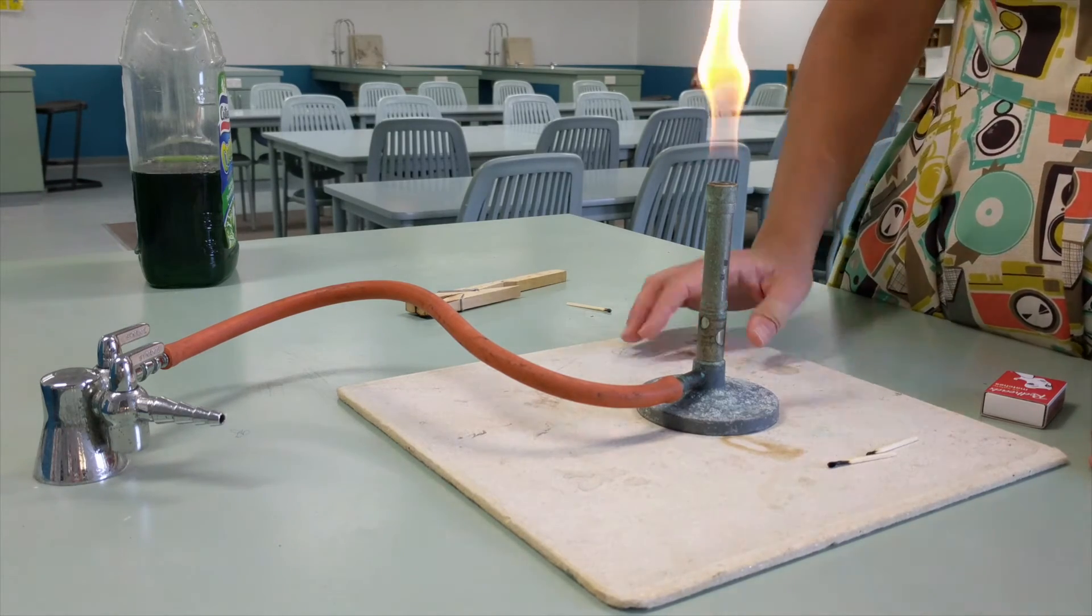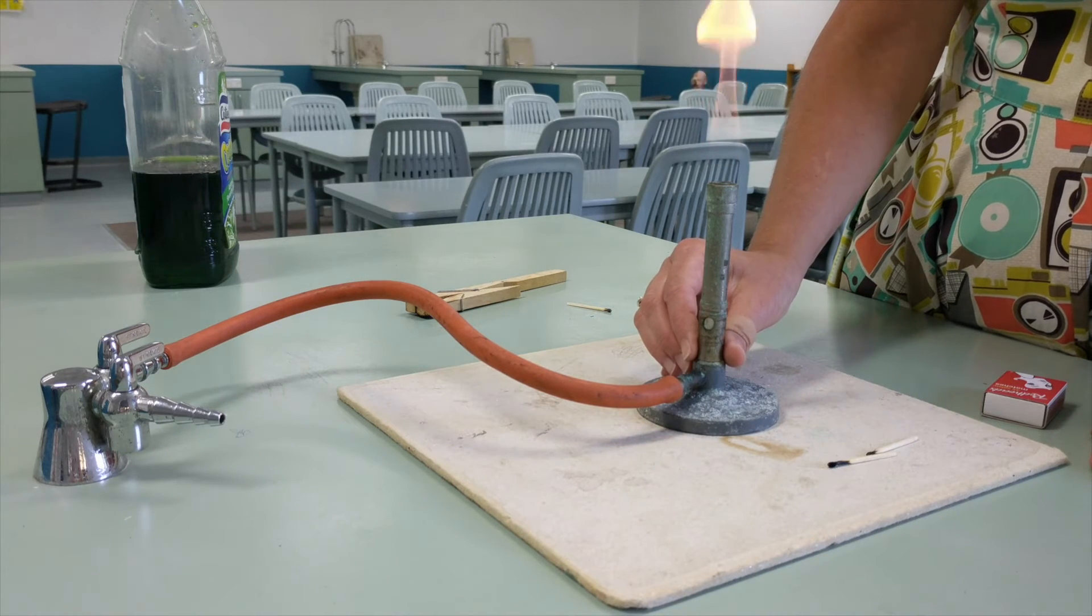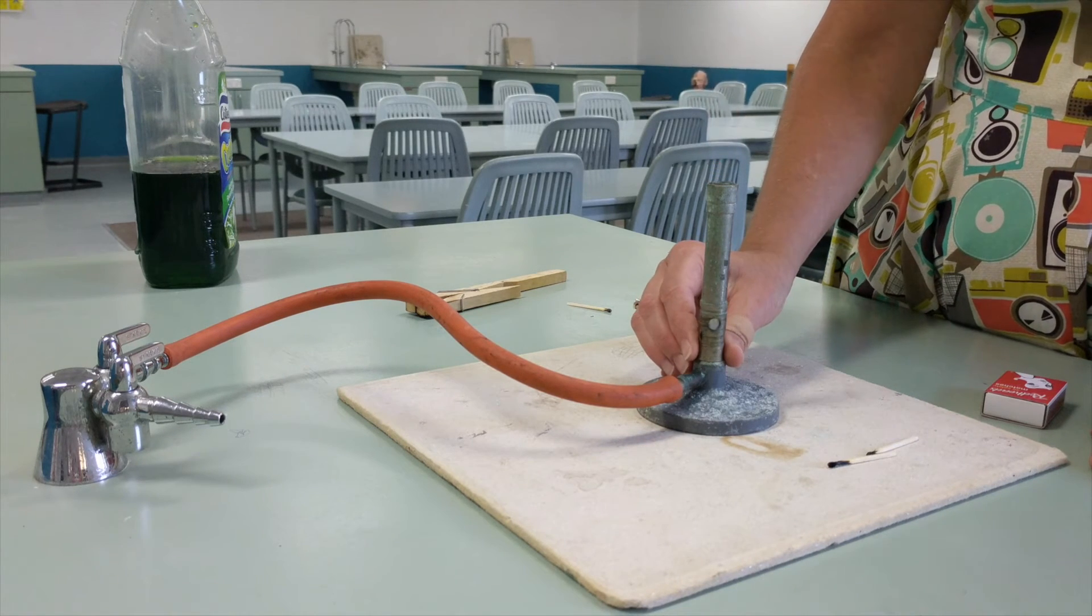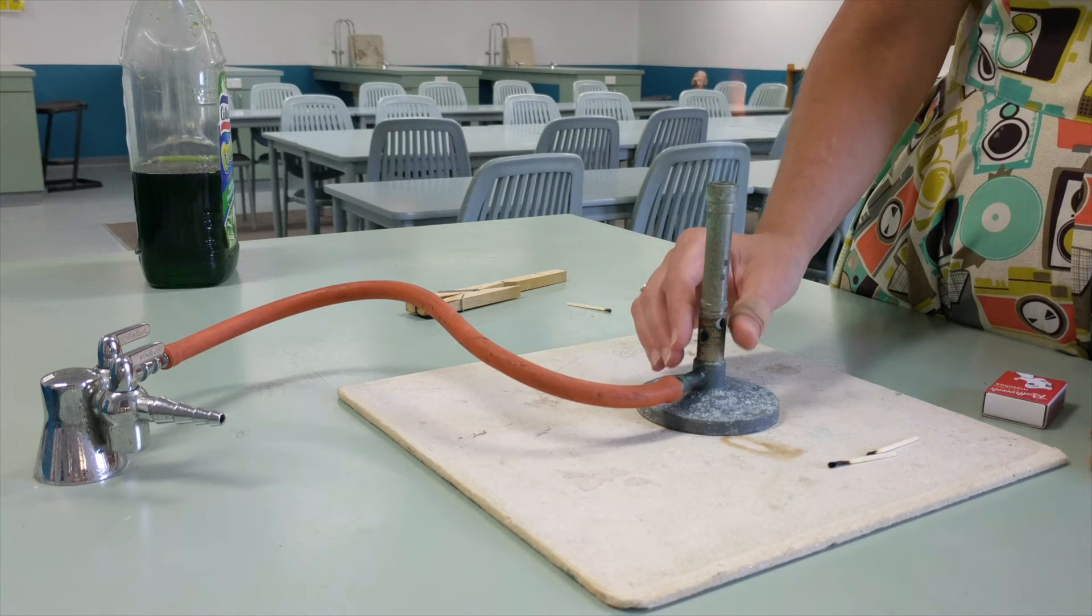When you're ready to heat, you slowly turn this part of the Bunsen. This is called the collar until the air hole is open. Don't be scared. None of this part of the Bunsen is hot.